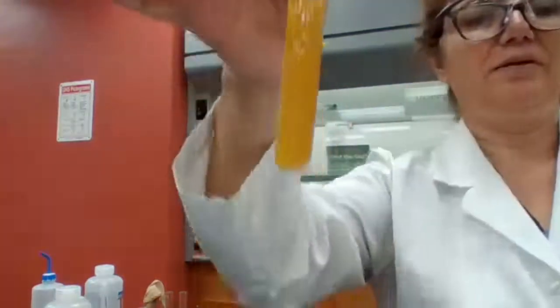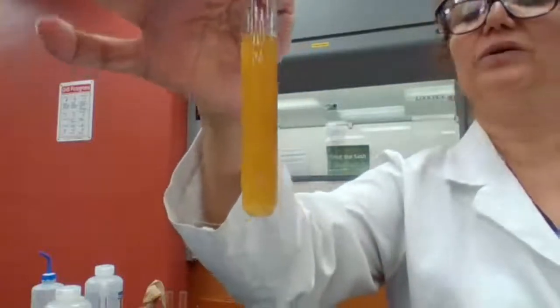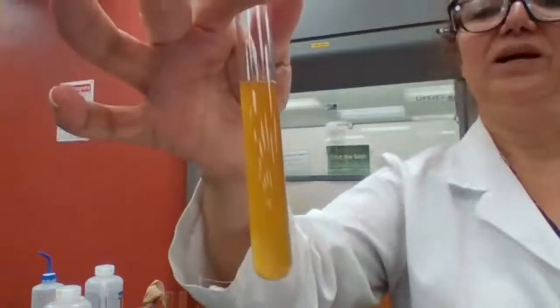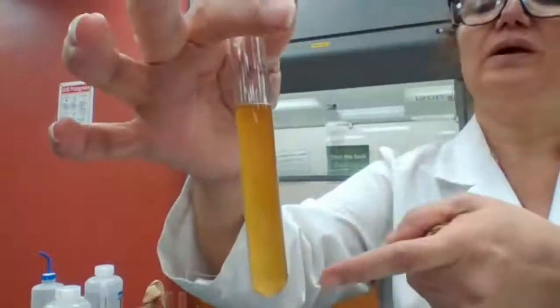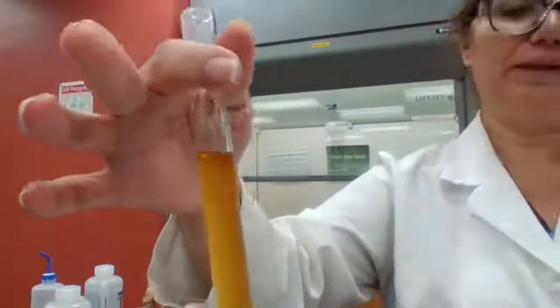Remember yesterday, one of the test tubes, this has nothing to do with today's experiment though. Don't get confused. Please don't get confused. This is from yesterday. I saved it because the yellow precipitate was not forming for acetophenone, and I didn't want to just discard it and say, well, it didn't happen.